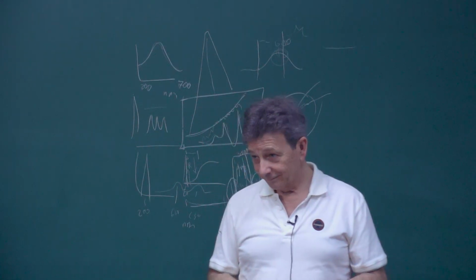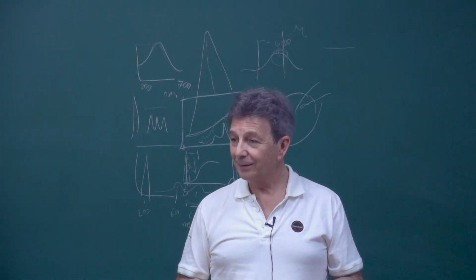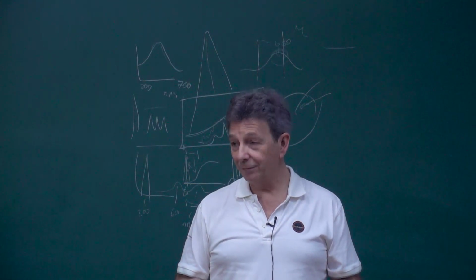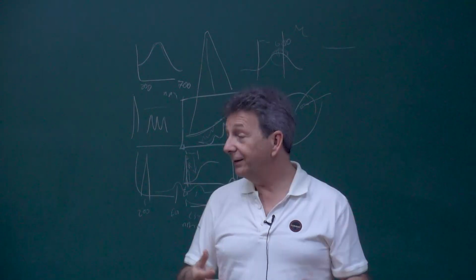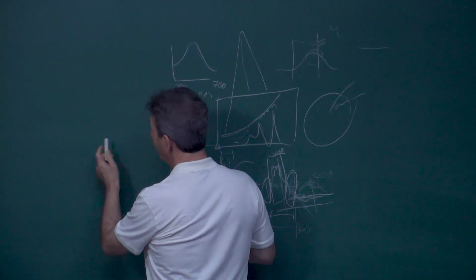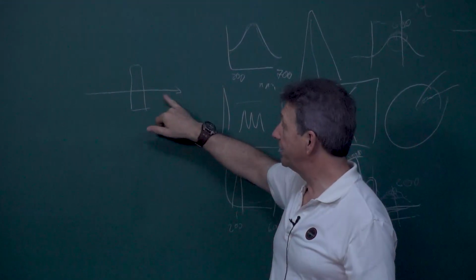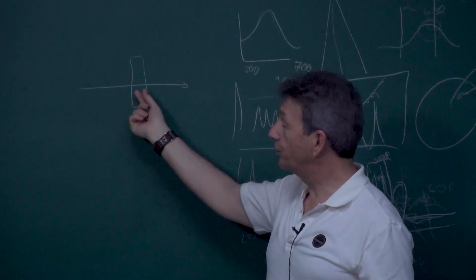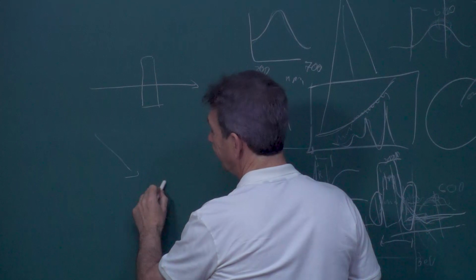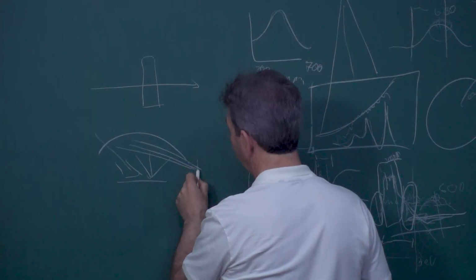Following that, there are two more questions. They would like to know what the Kubelka-Munk function is. It is typically used for diffuse reflectance spectroscopy to measure the intensity. For typical UV-Vis, you go through the sample and measure, so this is Beer-Lambert, which is very easy: you have the path, the concentration, and the absorption coefficient. But for diffuse reflectance, the radiation goes to the sample, and then all the light goes out in all directions, and mirrors concentrate everything and send it to a detector.